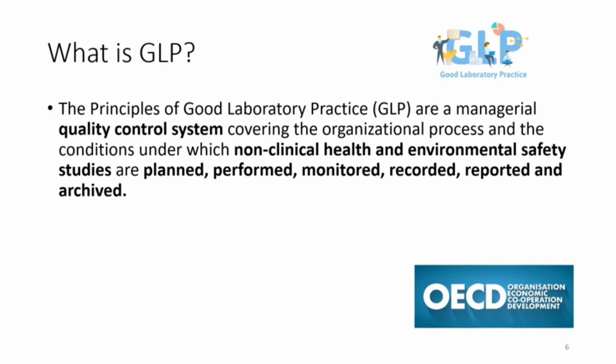Based on the OECD's definition, GLP is a managerial quality control system covering the organizational process and the conditions under which non-clinical health and environmental safety studies are planned, performed, monitored, recorded, reported, and archived. I have bolded a few keywords in this definition.